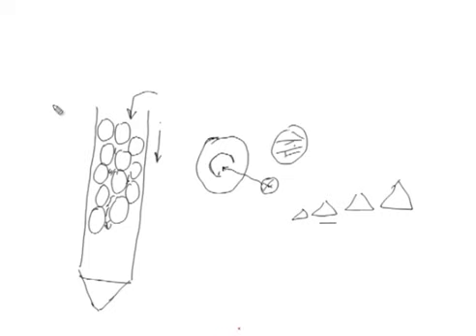Now, these columns, like I said, are long and narrow bore. So, they could be for low pressure, where there will be coarse beads or bigger beads, and for high performance liquid chromatography, there could be finer beads which are packed very nicely.